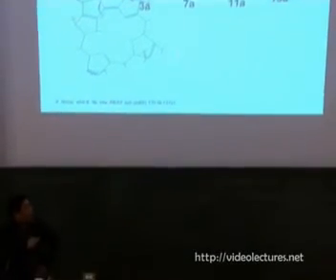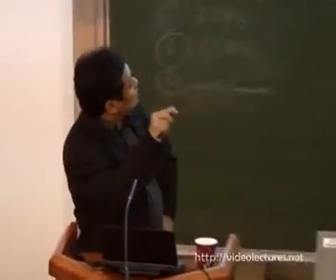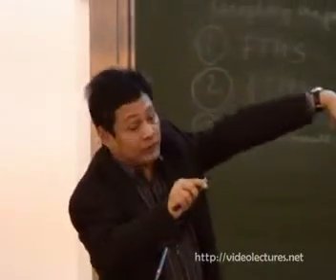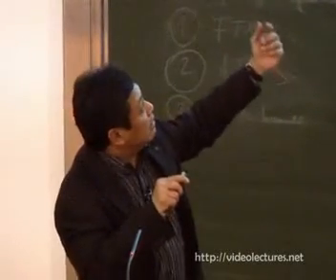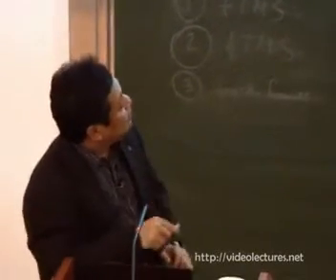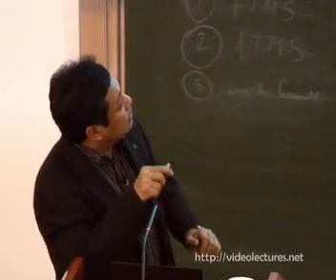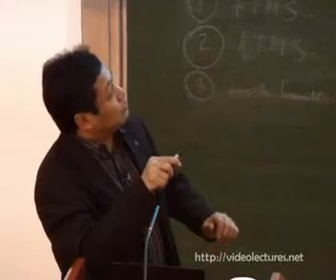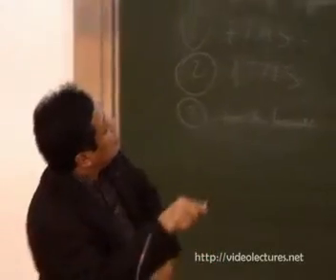We calculate isolated molecules. It turns out that chlorophyll stays like this: the porphyrin head, and then the tail is bent on top of the porphyrin ring. And this tail has 4 CH3 groups. It's like a bridge: the 4 CH3 groups are supporting this carbon chain. If you look from the top, you will see these carbon atoms 4, 5, 6, 8, 9, 10, 12, 13, 14 as higher. 7, 11, and 15 are lower because they are connected to the CH3 groups. So if you look from this angle, you will see these 3 triangles.